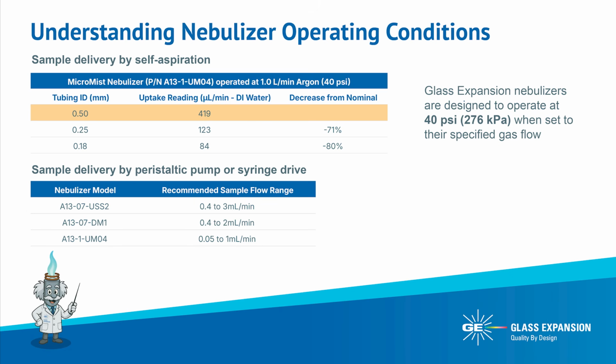It is acceptable to rinse and uptake at much higher flow rates for short periods, but it is important to allow enough stabilization time for the flow rate and nebulization efficiency to return to normal measurement conditions. This ensures good short-term RSDs for replicates. If the first replicate of your sample always seems to be the outlier, it's an indication that more stabilization time is necessary.